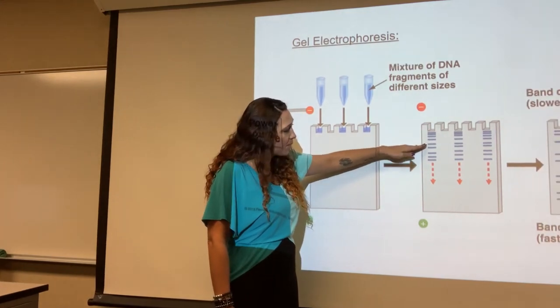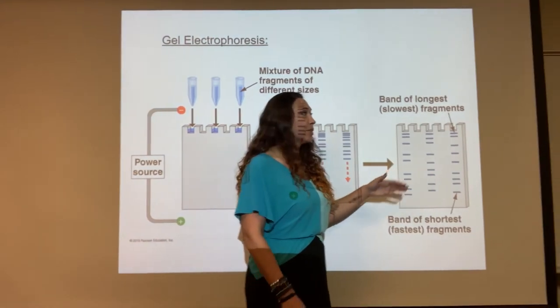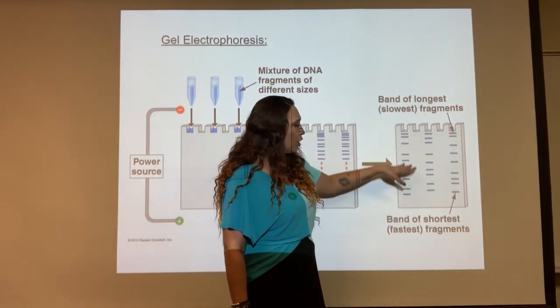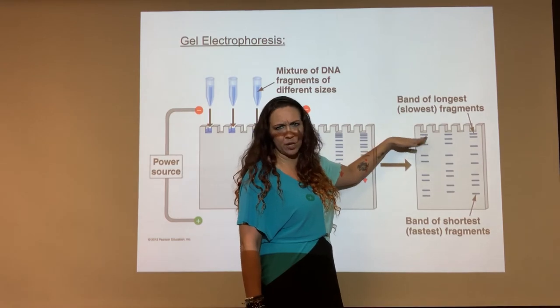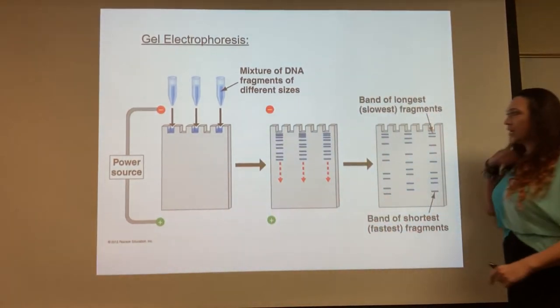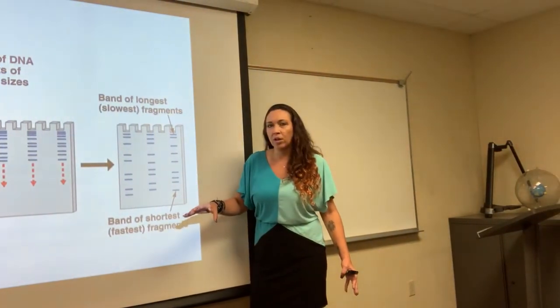As they get separated by size, they're finally going to be stopped in certain places. The smaller fragments are going to go the farthest, so they're going to go all the way down here. The larger fragments are harder to move, so they're going to be up here because they're heavier and larger.